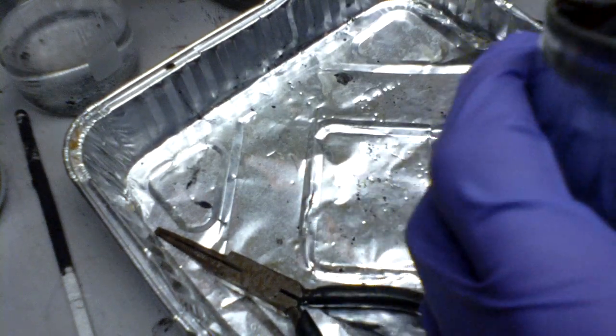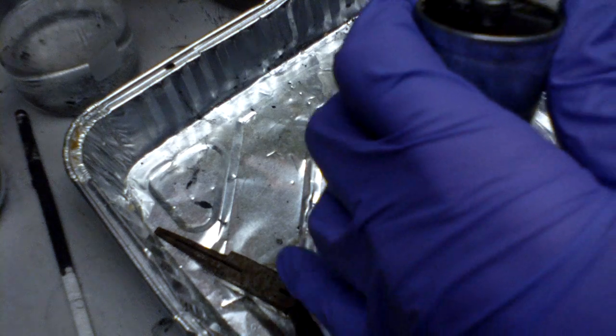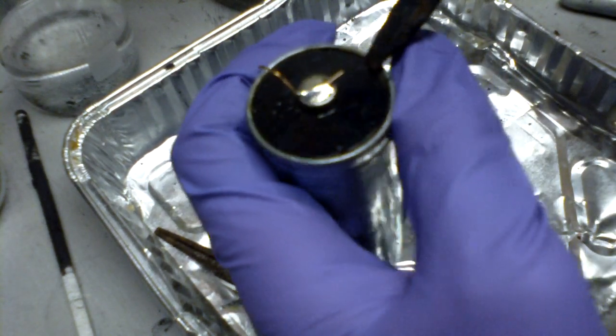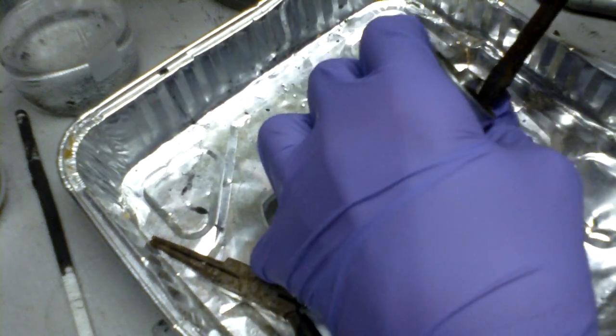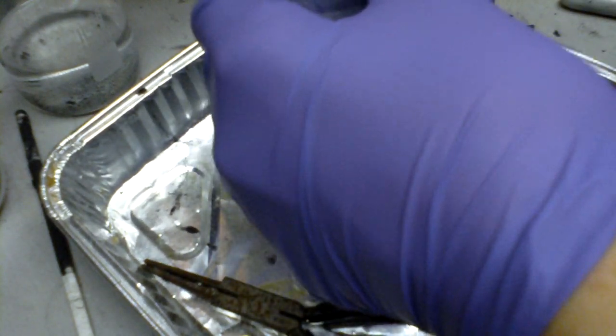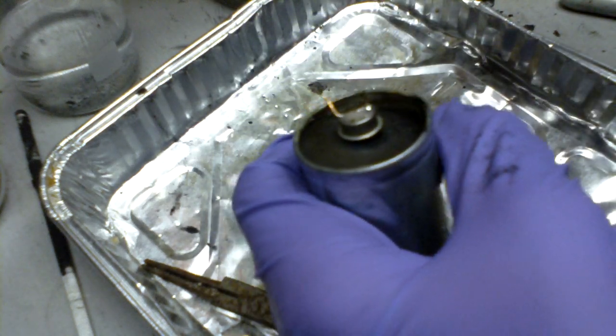Now in order to take apart the battery, the first thing you're going to have to do is put on safety glasses. And then you have to pop off the black seal with a screwdriver. There you go, it's off.